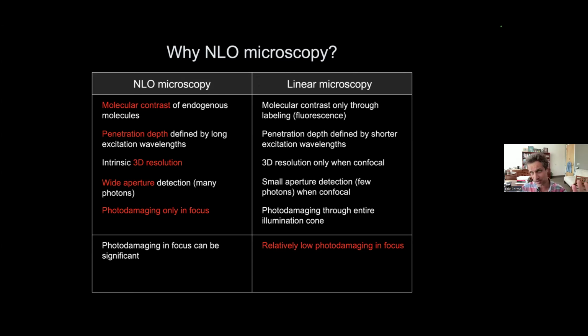That is not the case in linear microscopy. Usually the light fluxes and the density in focus are less than for nonlinear microscopy, in terms of the damaging potential. Also, it's quite expensive to do nonlinear optical microscopy because you need special light sources, while in linear microscopy you can use much less expensive light sources. And this is sometimes very important, because not everybody can afford expensive machines, and therefore it's just less applicable and accessible to everybody else.